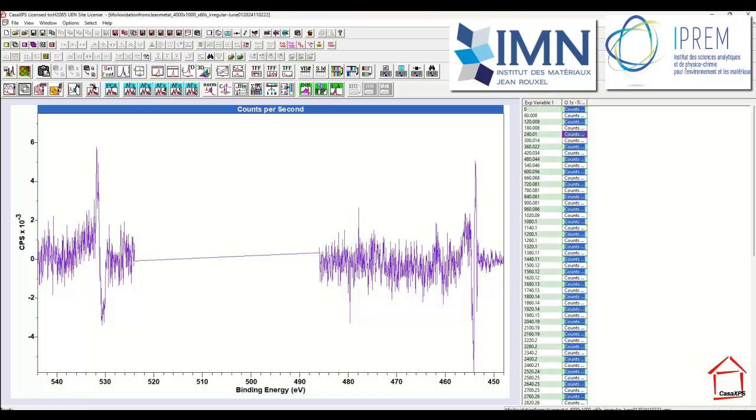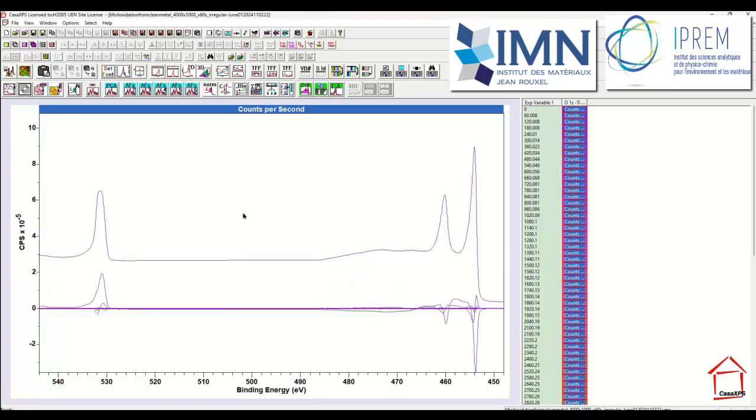Now I saw a large number here, large in terms of what I can manage myself, of abstract factors that I might want to try and use to analyze these data. Too many: four, 5. We're talking 5 dimensions in which we're working, and I would rather work in 2 dimensions.